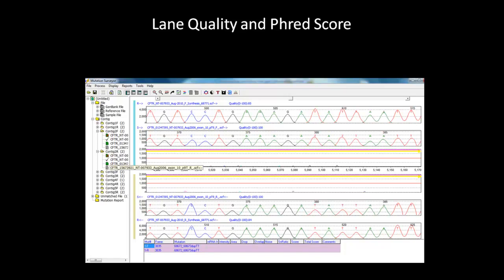In addition to editing variations, mutation surveyor also has many quality metric display options. When looking at the main analysis window for each sample, the lane quality score is displayed on top of each reference and sample electropherogram. This score is a signal-to-noise ratio of the trace before alignment. It gives an indication of the quality of the data, zero being the worst and 100 being the best.